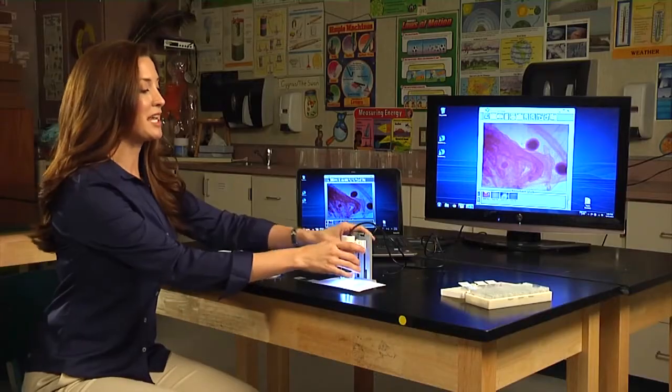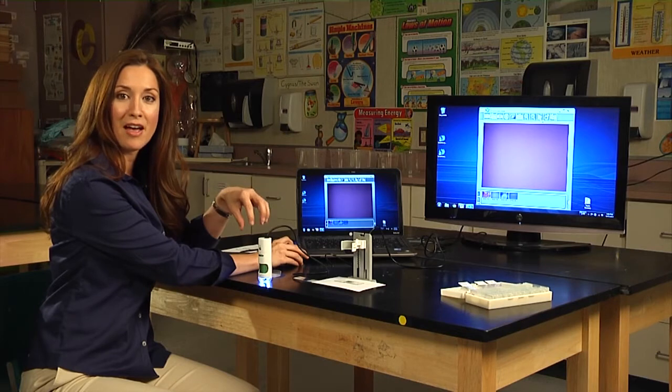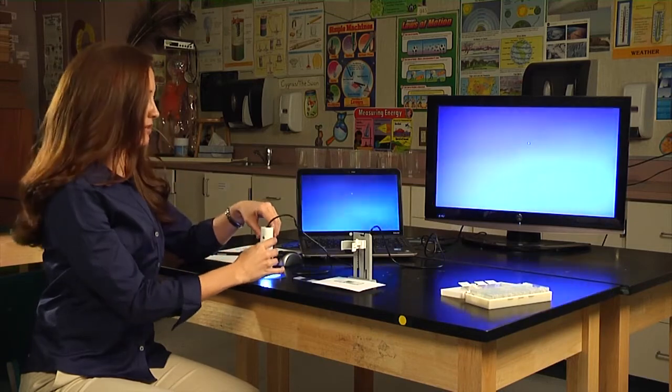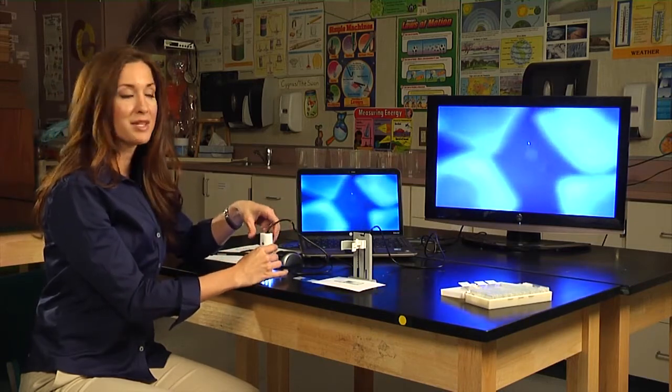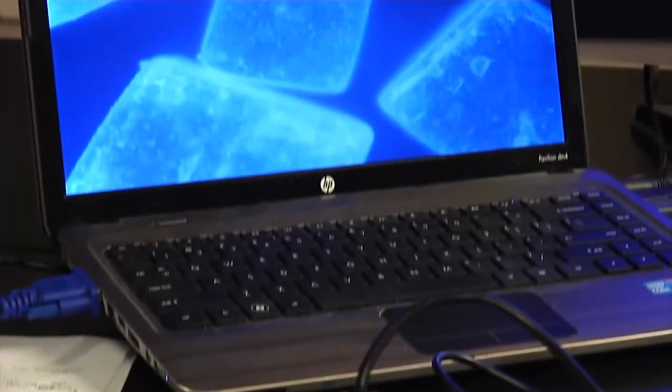The SmartScope 500 can also do things that you cannot do with a traditional microscope. Since it's handheld, you can use it to view anything you want to get a closer look at. Let's go back to clear out the picture. This brings us back into the live mode, and then double click again to bring us to the full screen. Let's take a look at some traditional table salt. You can place it directly on the salt and then use the focus dial to bring the salt into focus.